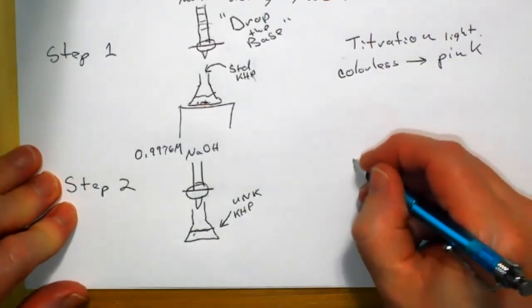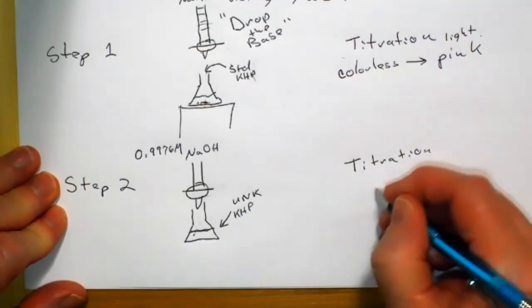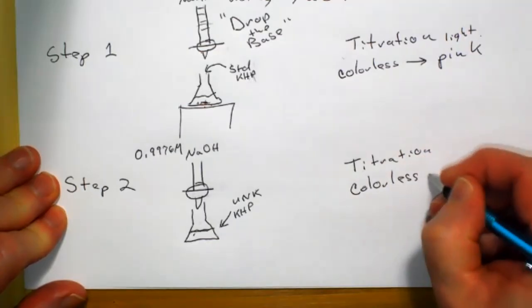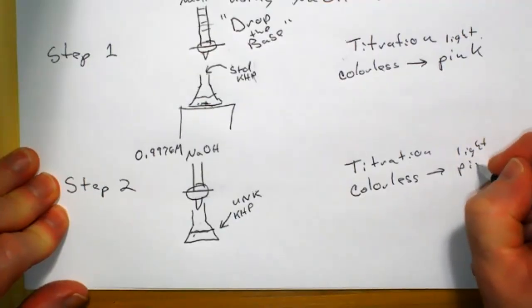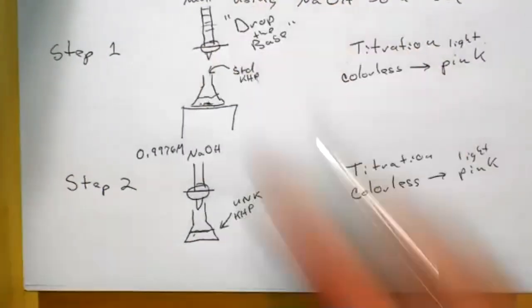So this titration, we go colorless to light pink. A similar endpoint will give us perfect results.